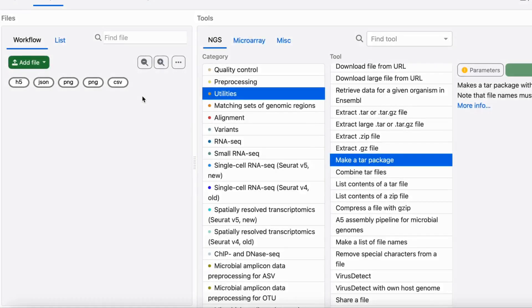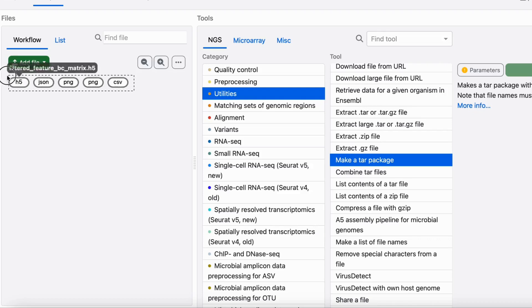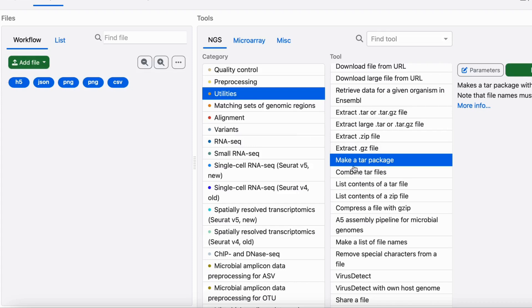Now let's take a look at how to use this tool in CHIP-STIR. If you don't have the input files in a tar package, you can import each input file into CHIP-STIR separately. After you've imported the files into CHIP-STIR, you can select all of the files and use the tool make a tar package from the utilities category to make the tar package.